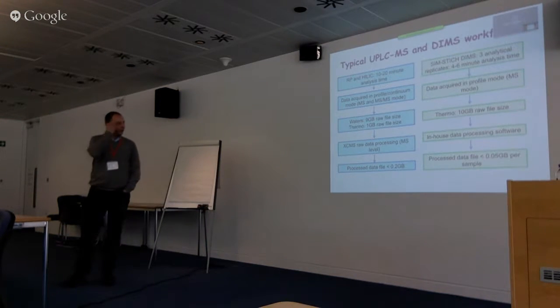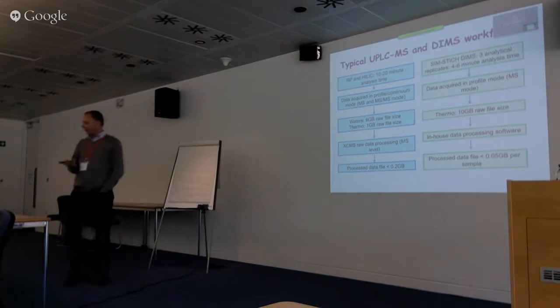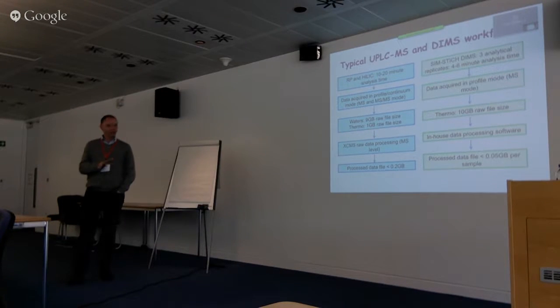And these are just our typical workflows. I think it makes us think about where. I personally think data compression will want to come in here as well. We just need to decide the level of data compression or reduction, and at what stage it is performed.